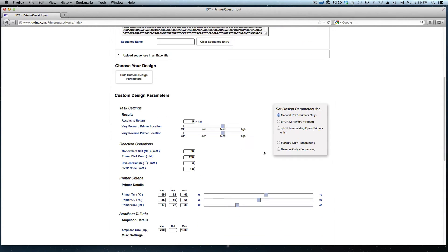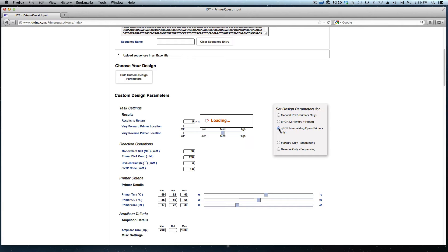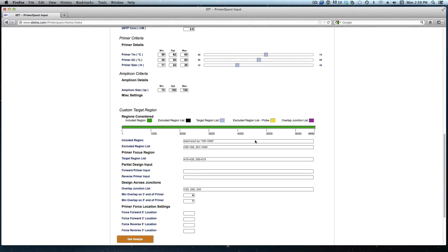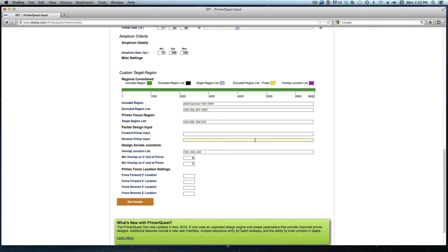Since I do want qPCR primers I am first going to change this design parameter set to the qPCR intercalating dye option. After those parameters reload I need to scroll to the bottom for the custom target region section.